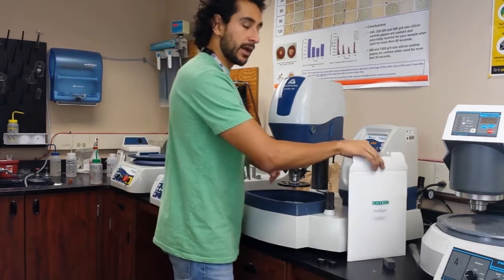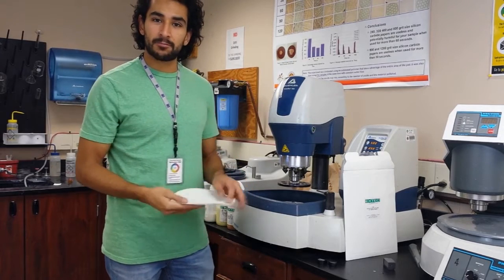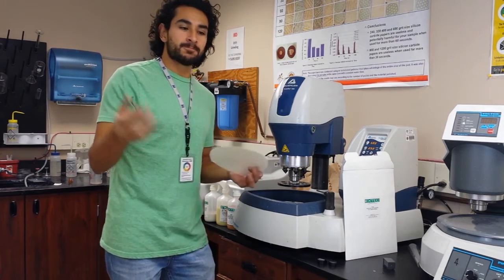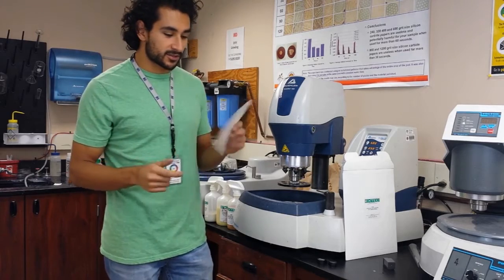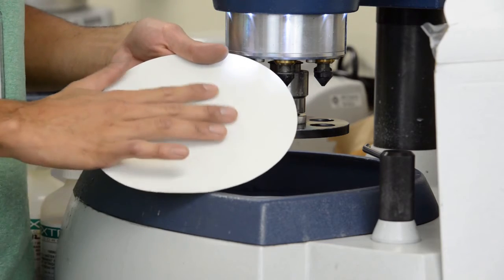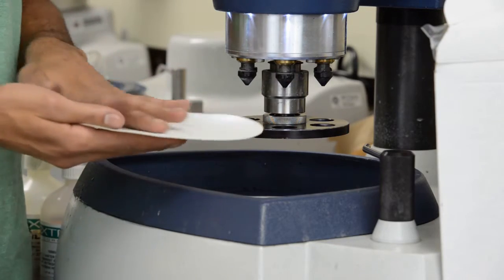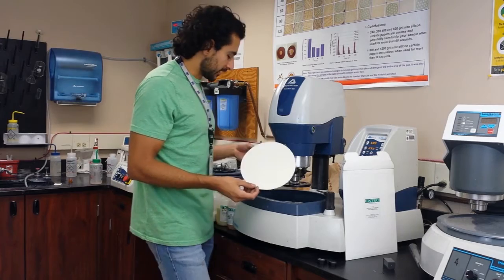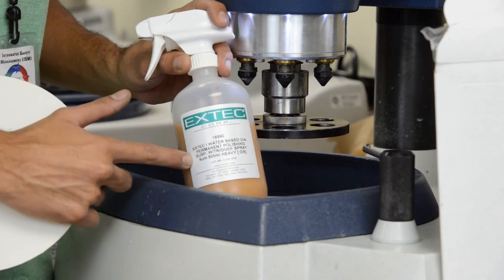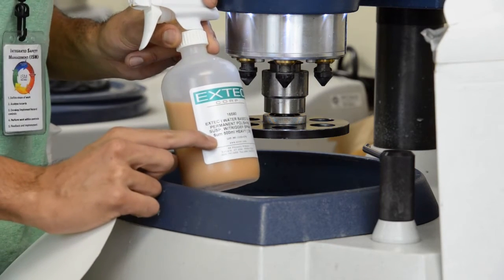The previous step with the blue diamond impregnated pad — the surface didn't look that much better. With this one, it will. This is actually a really good step. This is the nylon pad — just a nylon pad. It's non-abrasive, so if you put your sample on top and start polishing, it's not going to take that much material off. You actually have to couple it with this — a water-based diamond suspension. This particular one has 6-micrometer size particles in it.